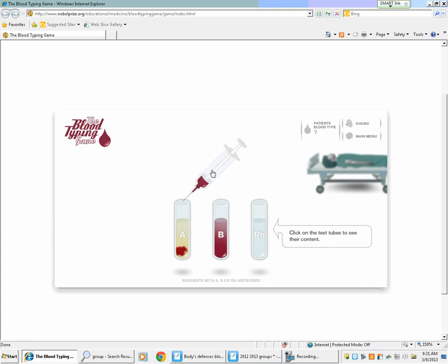May I get a training doctor? This is House. You guys are the trainees. May I get a training doctor? Dr. P, back there. Or soon to be Dr. P. Can I get your hypothesis for test tube A?